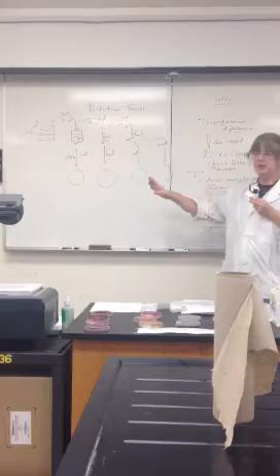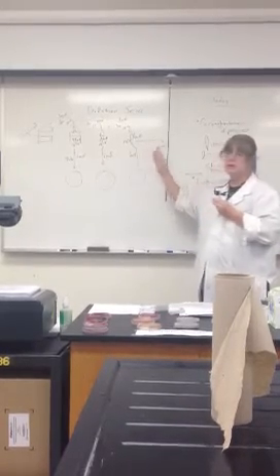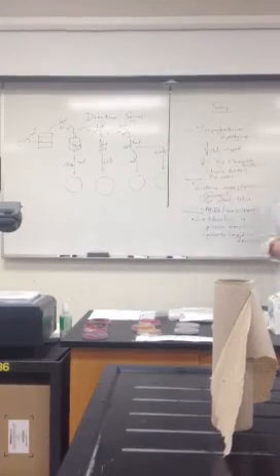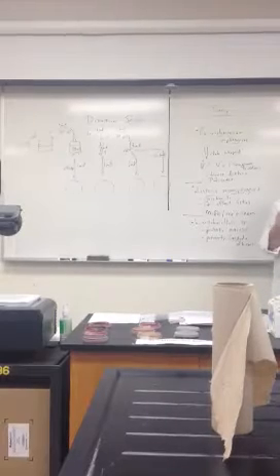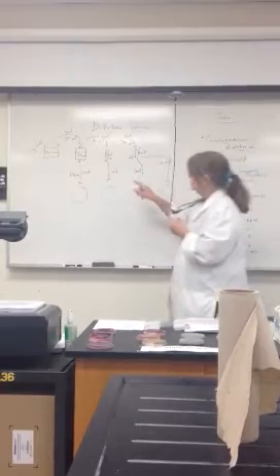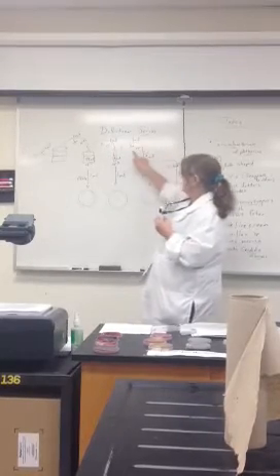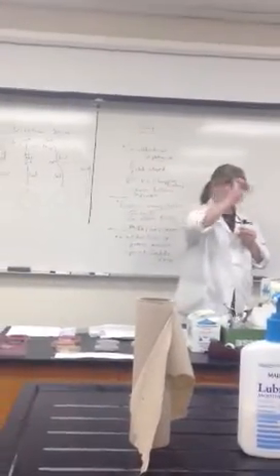This is a pattern. I could have gone 1 ml into a 9 ml test tube, or I could have done a 99 ml over here, so learn what they are, right? Then I took 1 ml and put it into 9 mls from the sample. I have decreased the organisms now, haven't I? Thinking through it logically can help you understand. Well, 1 over 10 is another 1 to 10 dilution. So from here to here is actually a 1 to 10 that you have processed. You take 1 mil into another 9 mil, that's another 1 to 10 or 10 to the minus 1. That is what you're doing.